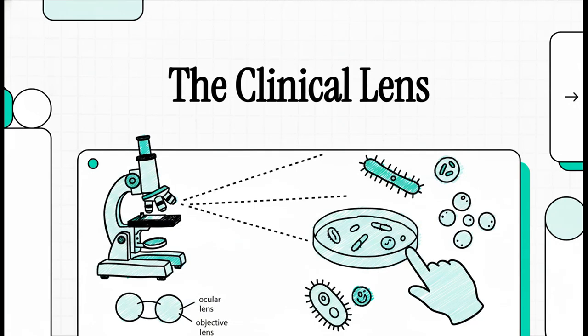You just wrapped up looking at the methods of microbial investigation. We talked all about how to culture and handle microorganisms, right? Well, now we're diving straight into the actual tools that make those investigations physically possible. As future healthcare pros, you're going to rely heavily on someone, maybe even yourself, looking through a clinical lens to identify an invisible threat. So today, we are unpacking exactly how that lens works.